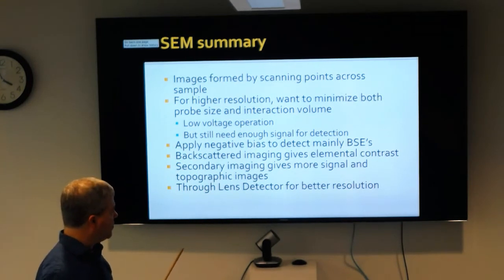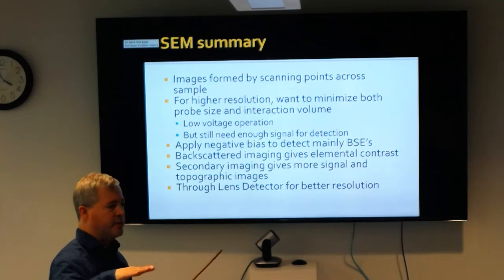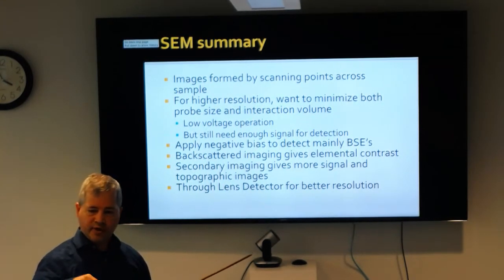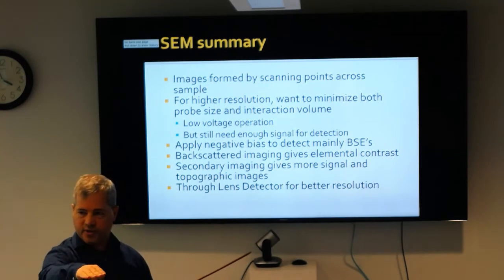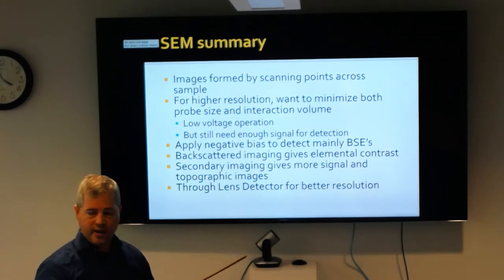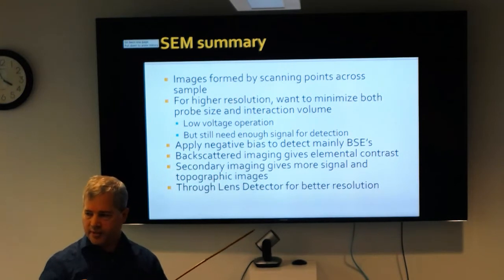Those can be a little more difficult because sometimes they can be quite sensitive. Sometimes they have to go in and out of the sample as you're imaging it. So when you want to go into backscatter mode, you have to shoot the detector in, and then you have to be careful of the geometry of everything so that it doesn't damage the sample and all that. The SEM is quite a bit different than the TEM in that the chamber is often pretty big.